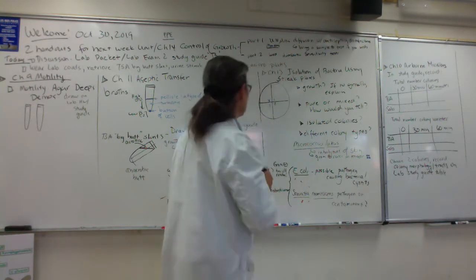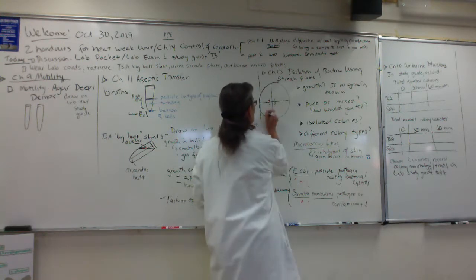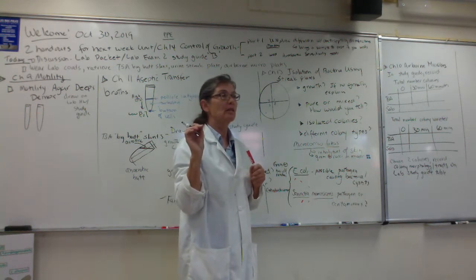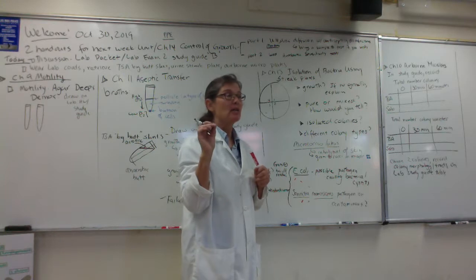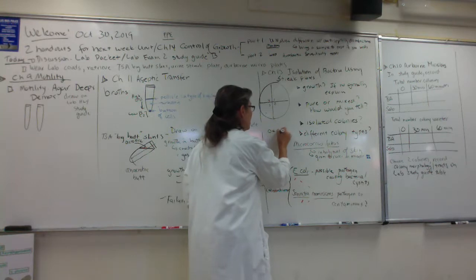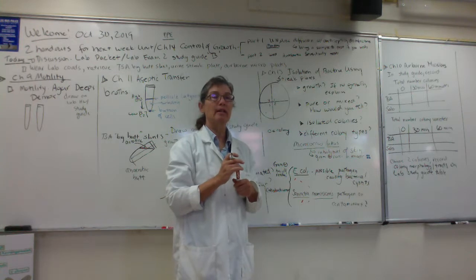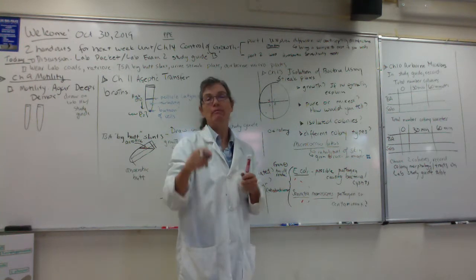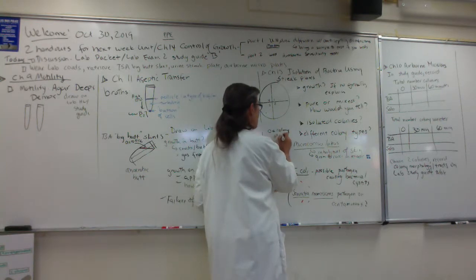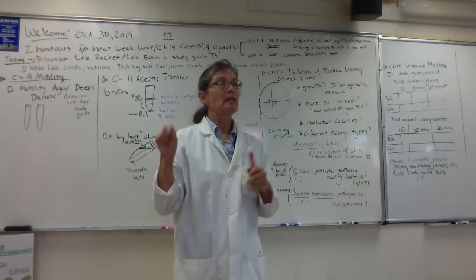So you guys, what's the big deal about an isolated colony? Is an isolated colony, you guys, a colony not touching another one, do we consider it a pure culture? Yes. Yeah, because our hypothesis is that all the cells, so I'll do a colony here, you guys, in that colony descended from one bacterium, right, or one fungus that landed on your plate. And you guys, in one of those visible colonies, you can have 10 to the 8th to 10 to the 9th cells in a visible colony, right? So an isolated colony is a pure culture.